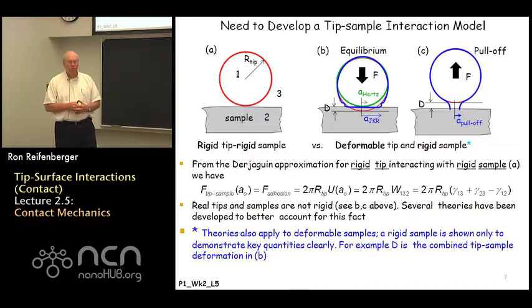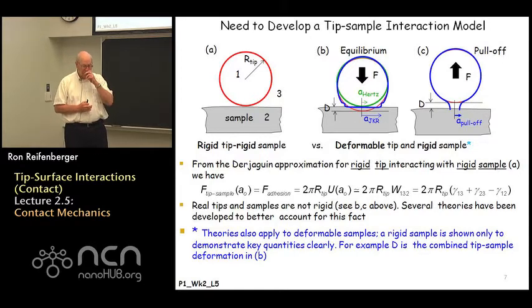What we need to do is develop in some detail a tip-sample interaction model. We've already discussed one such model, the one by Derjaguin. This goes back a few lectures. You'll recall that in that discussion, we related the adhesion force, in other words, the force required to separate a tip from a substrate.